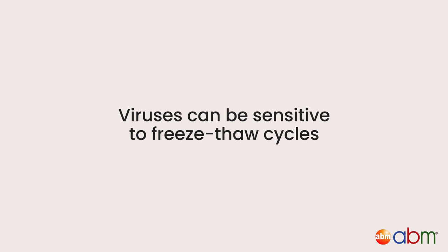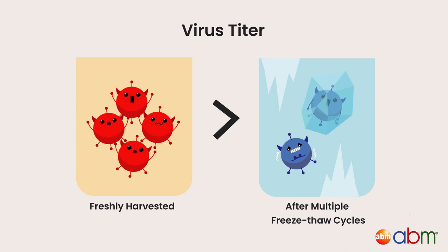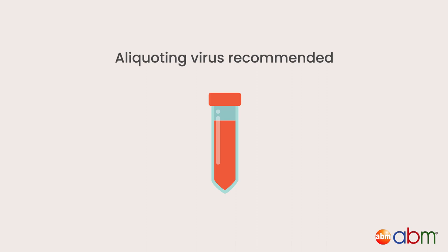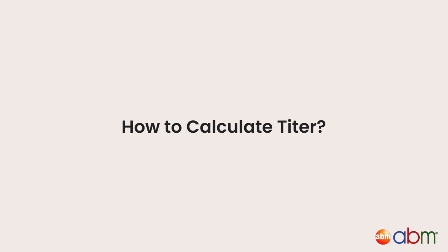Other considerations. Viruses can also be sensitive to freeze-thaw cycles, meaning that the titer of a recently collected sample can be much higher than if the same sample was stored in a freezer and thawed multiple times. To avoid losing viral titer due to excessive freeze-thaw cycles, it is recommended to aliquot the virus as soon as it is made and store at minus 80 degrees Celsius for long-term storage.